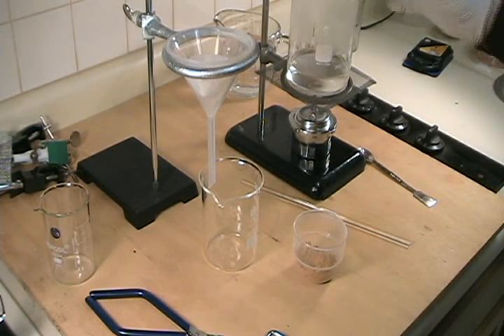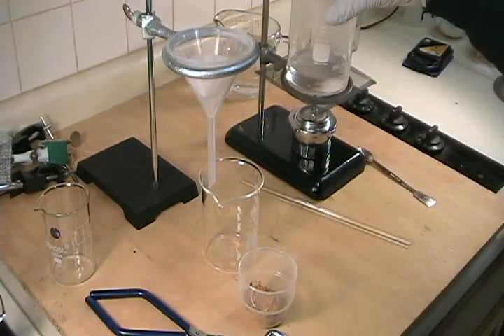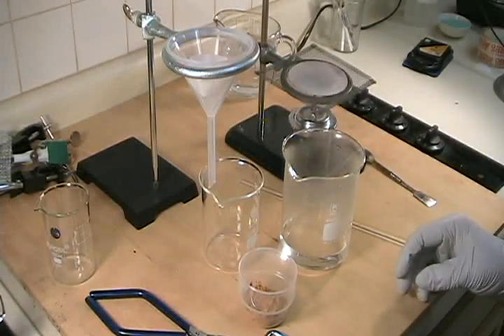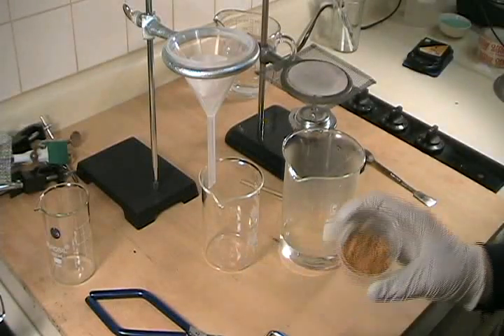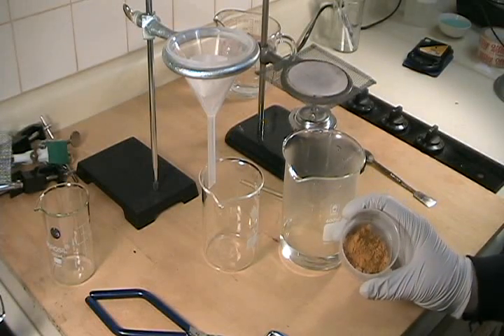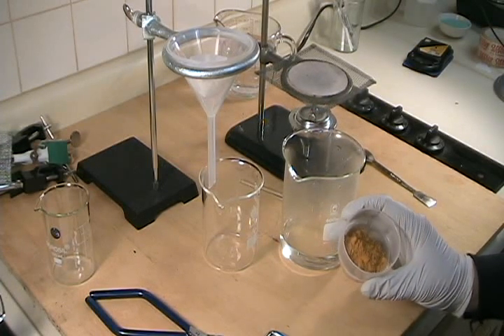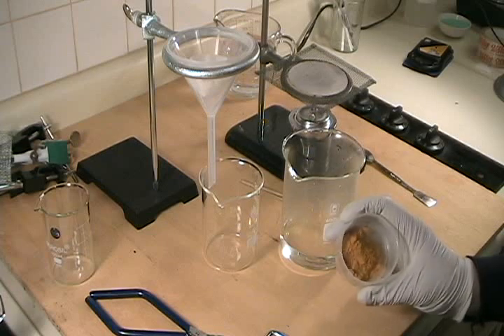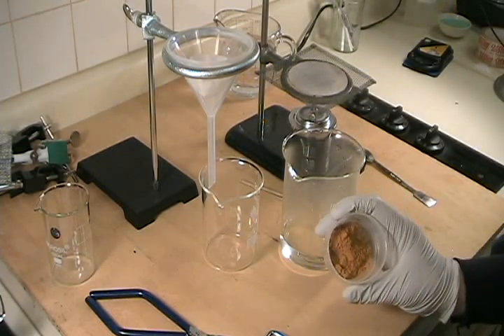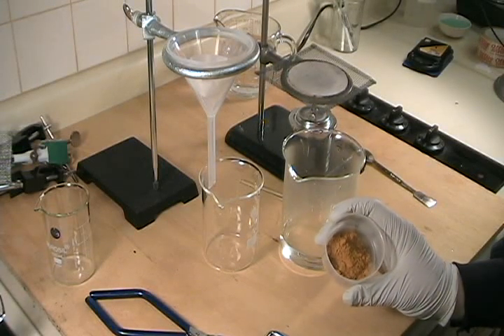I've already dissolved about 20 grams of anhydrous sodium carbonate in about 125 milliliters of water to produce the solution that we'll react our vanadium pentoxide with to produce the sodium metavanidate. Here's the vanadium pentoxide — I got this from Seattle Pottery Supply and it looks remarkably pure. I've seen technical grade vanadium pentoxide that is dark brown or almost black, whereas this sample looks very close to what I would expect a laboratory grade sample to look like. It's more of a deep brownish-yellow-orange color.